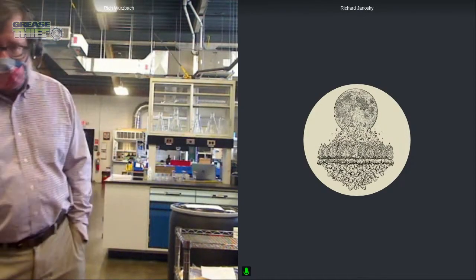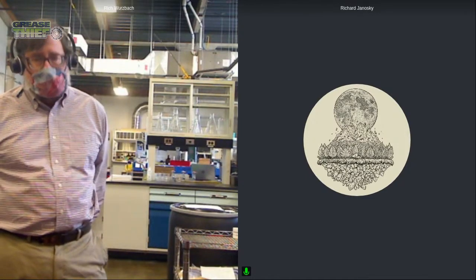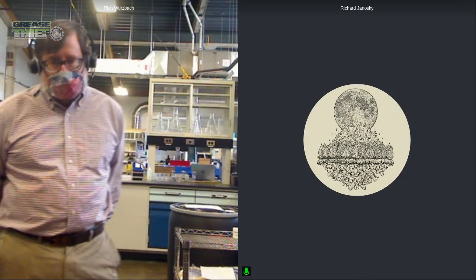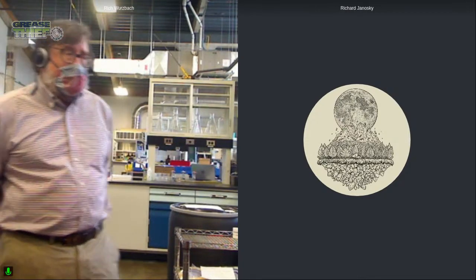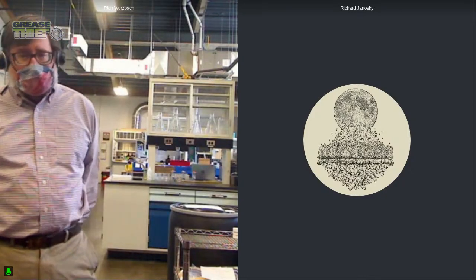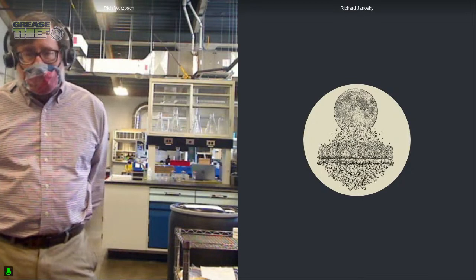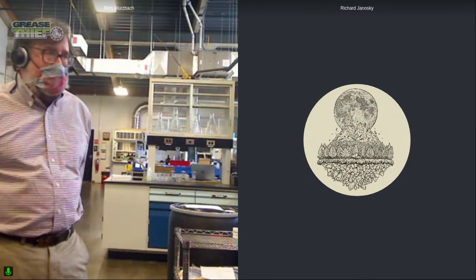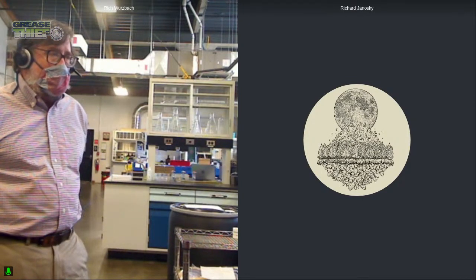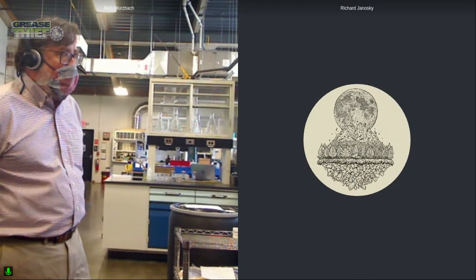No, Mindy did just ask a question, actually. She asked if you could hold the greases longer than 6 hours. She said that she's seen people hold it for 24 hours. Yeah. And again, sometimes if you're going to hold it for 6 hours, you're into a back shift anyway, so why not hold it for 24? Some of that, I think, goes to efficiency of process. I don't see any downside to holding it for 24 versus 6.